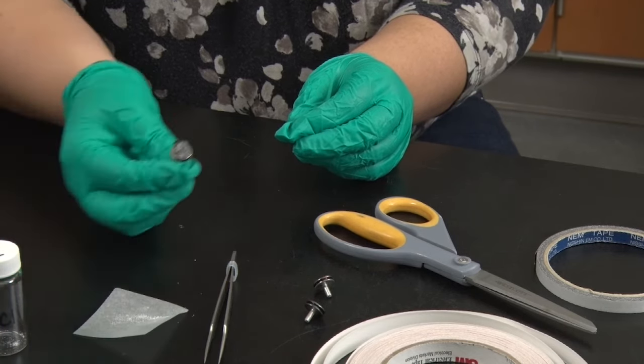This image of the uncoated salt shows some streaks and some bright and dark spots that don't quite look right. This is the charging effect that we discussed earlier. Because the sample is not conductive, it is building up a charge, and this makes it very difficult to image it properly with a charged beam of electrons. It would be impossible to collect a good image under these conditions.